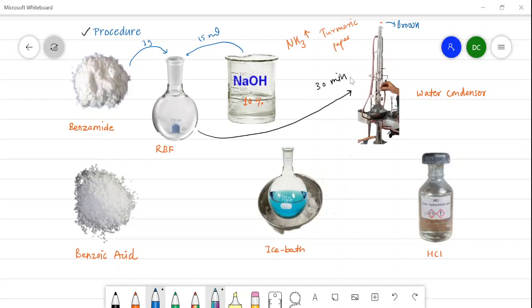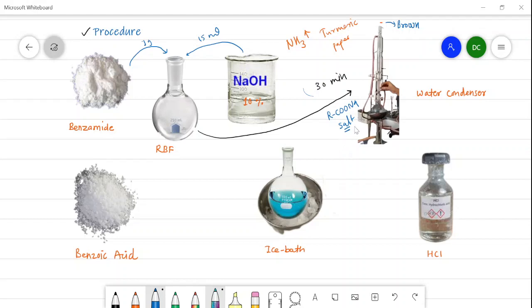After sufficient heating — about 30 minutes — all the ammonia is evolved. When the reaction is complete, placing the turmeric paper on top shows no color change, indicating completion of the reaction. At this point, the product in the round bottom flask is the sodium salt (R-COONa). The flask is then removed from the water condenser and kept in an ice bath.